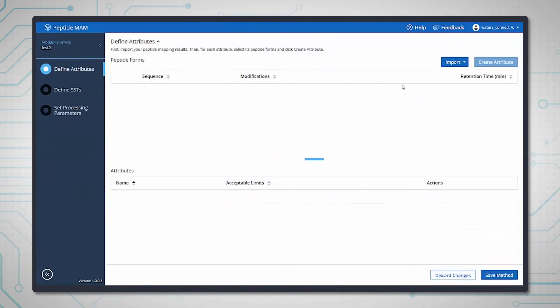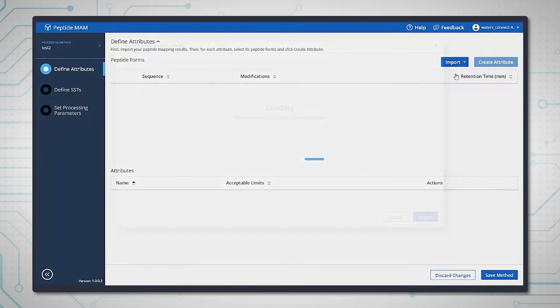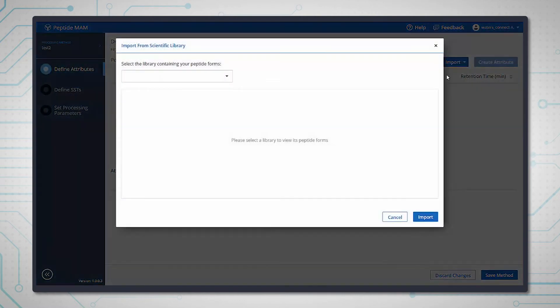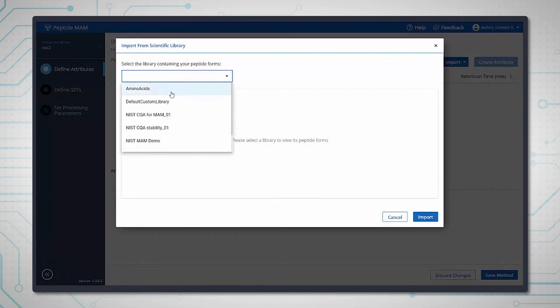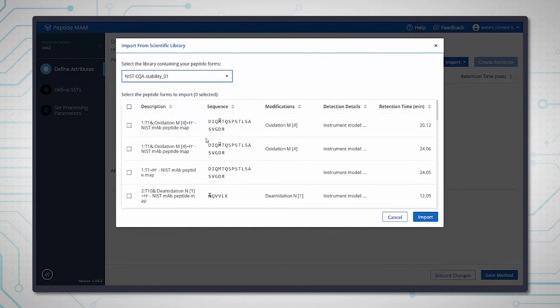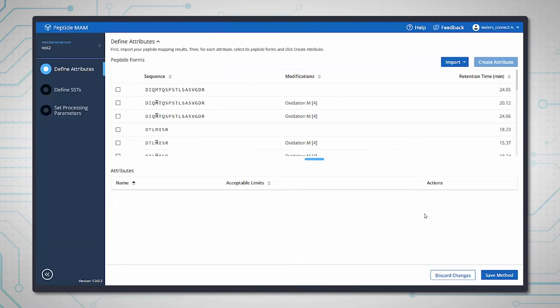Setting up a Peptide MAM app analysis is very straightforward. A list of product quality attributes can be exported directly from a Peptide Mapping analysis in UniFi and stored in the scientific library.